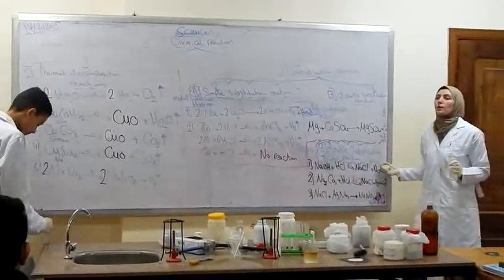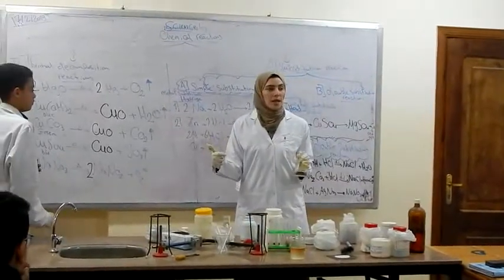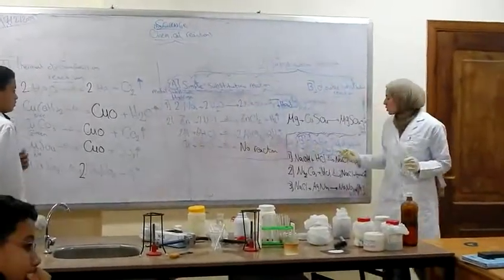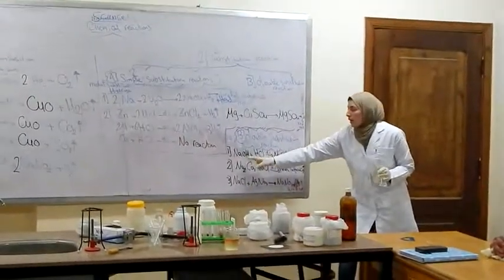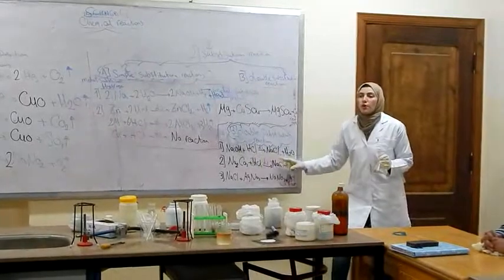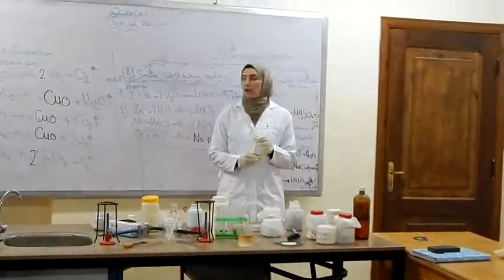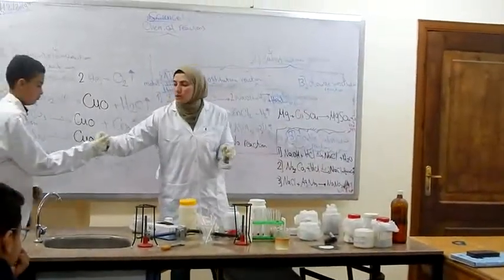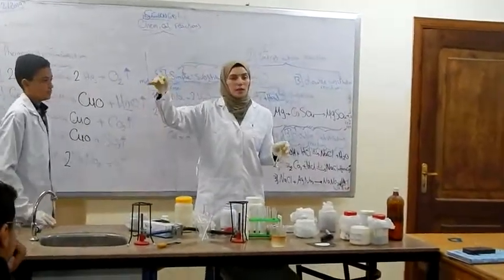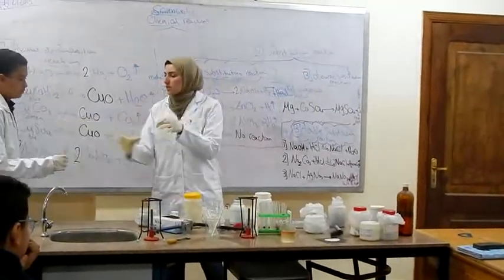So what do I mean by neutralization reaction? A reaction between acid and alkali to form salt, NaCl, and water. Now we perform the neutralization reaction between sodium hydroxide alkali and hydrochloric acid.